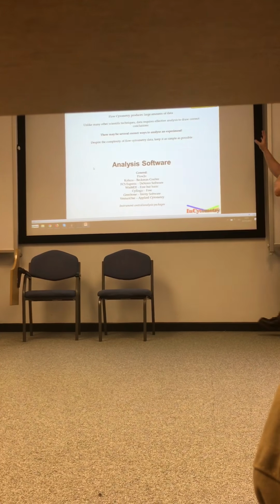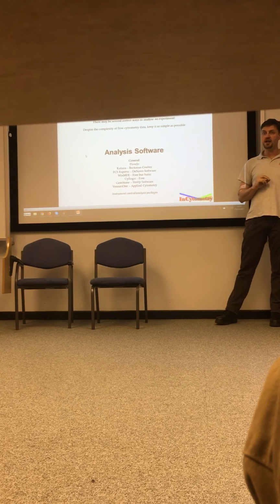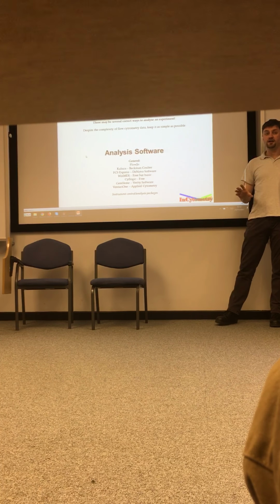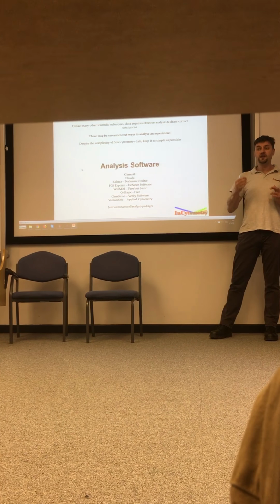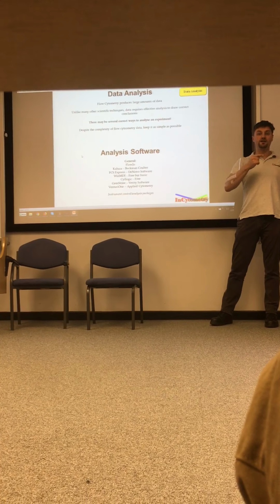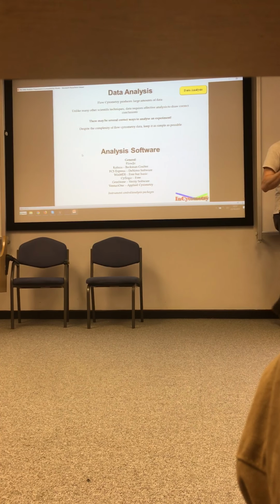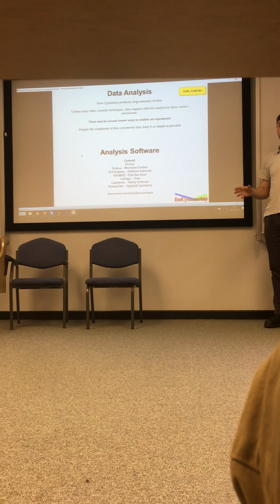So I've always taken the approach that if someone says to me, oh, I'm analysing my data, is this right? If I look at it and it's not the way I'd do it, but it's correct, I will say, yep, that's fine. I might do things a little bit different. And if they say, well, how would you do it? I'd say, well, this is my approach, but my advantage is this, but then it has the disadvantage of this and this and this. I would never say to someone, no, you've done it wrong, simply because it's not the way I do it. And often you can do 2 or 3 different gating strategies and you end up with the same data. Okay? It's whether it's correct that's important, not which way you do it.